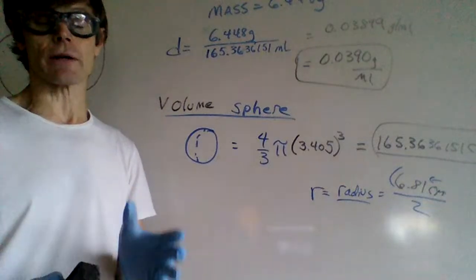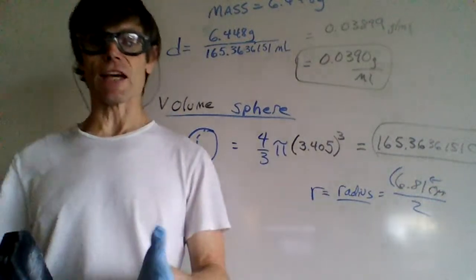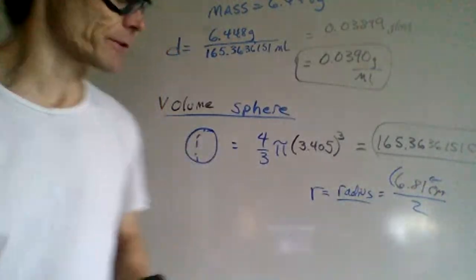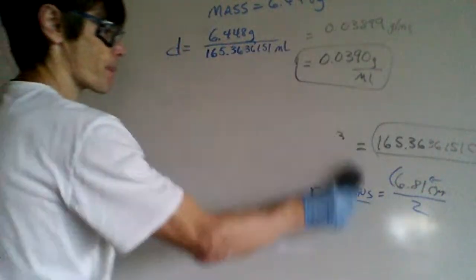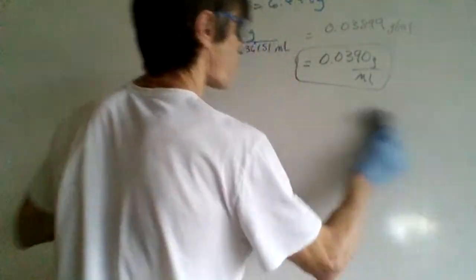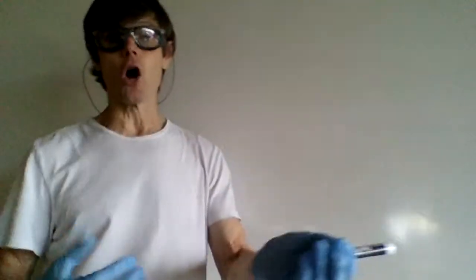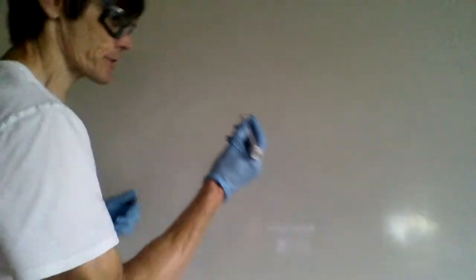Another way of measuring volume, and this is often the case for irregularly shaped objects, is using water displacement. So water displacement is another experimental way to measure volume, and we would measure its mass using a balance. Let's define what we mean by water displacement.